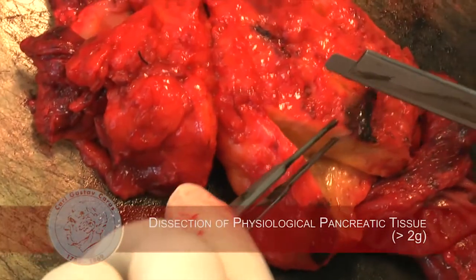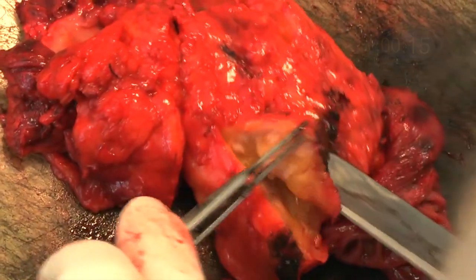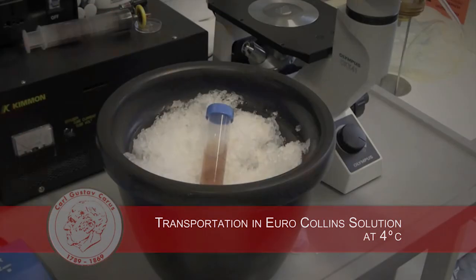The pathologist determines the amount of healthy appearing and soft pancreatic tissue to be procured for the islet isolation. At least 2 grams of pancreatic tissue are required for isolation. The tissue is placed in preservation solution and carried on ice to the laboratory.